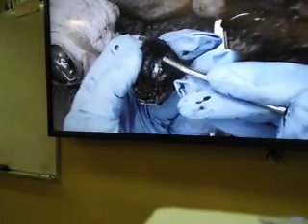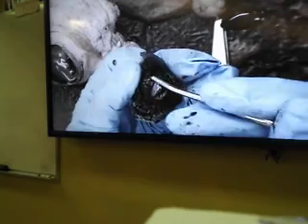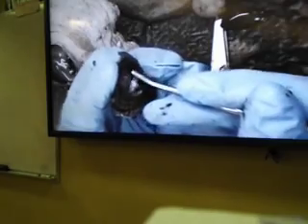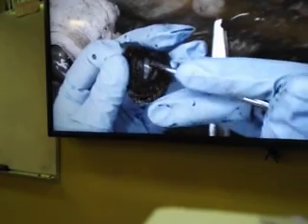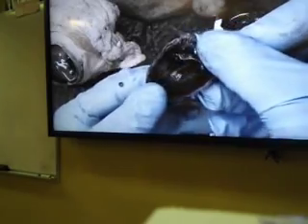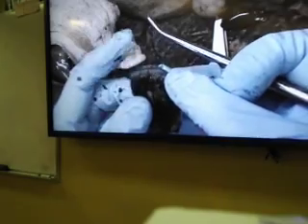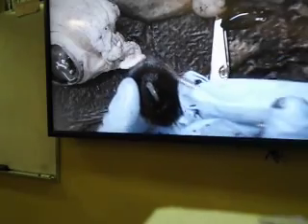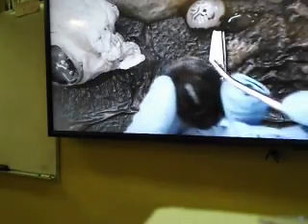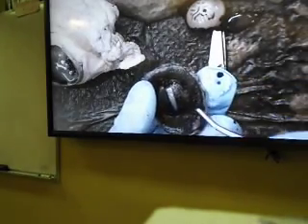Alright. Surrounding the pupil is this black ring. Directly surrounding the pupil is this black ring which doesn't have any lines on it. And this black ring directly surrounding the pupil is called iris. Now, directly posterior to the iris, you can see there is a black structure which has a lot of lines on it, and through which you saw the suspensory ligament holding the lens. So this structure is actually the ciliary body.